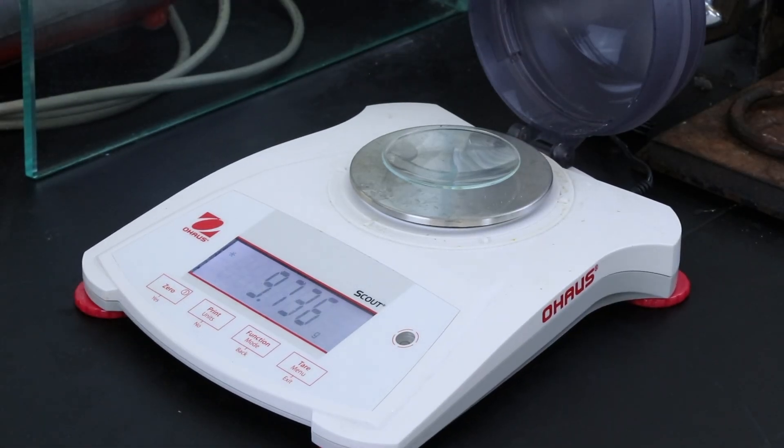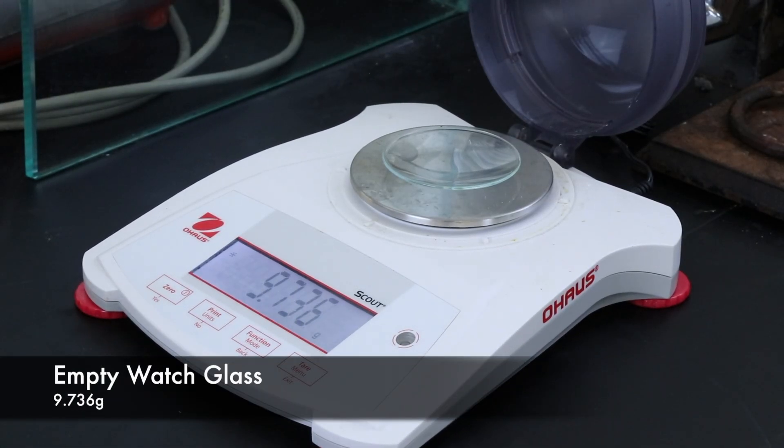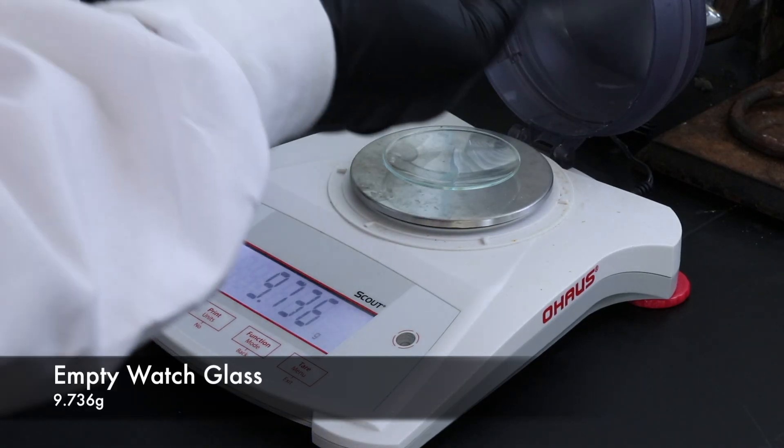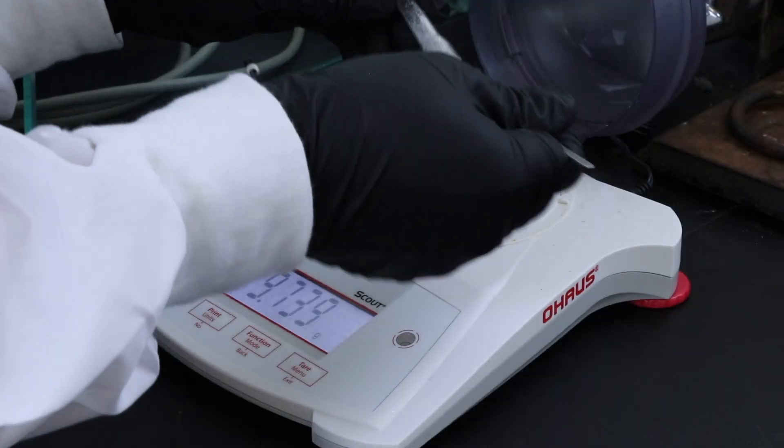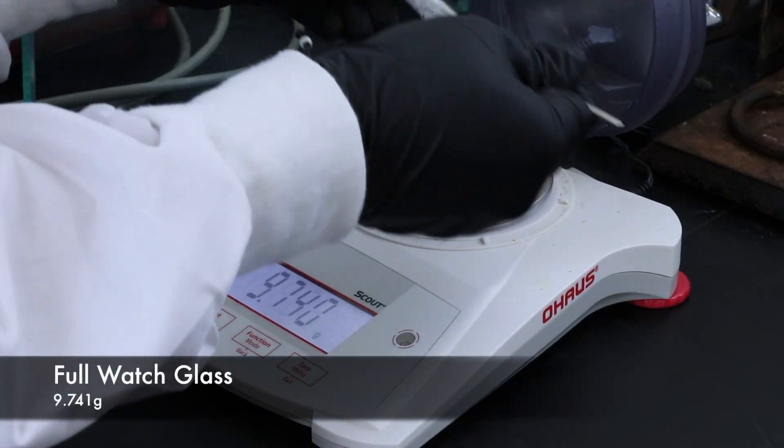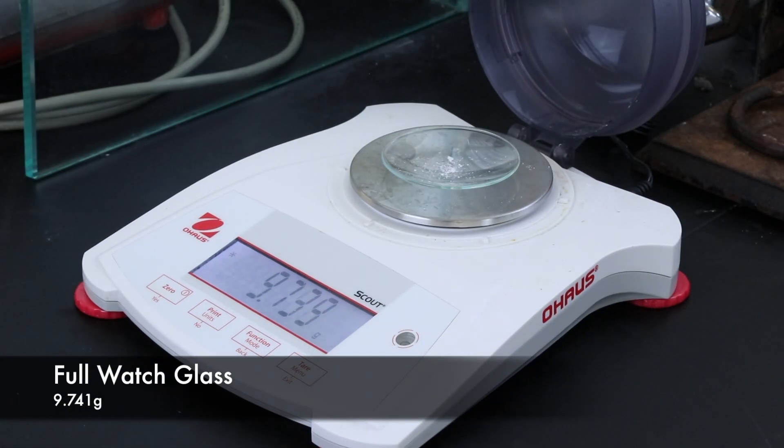Now I'll weigh out the crystals so we can calculate a percent yield. The empty watch glass is about 9.736 grams and the product only made it jump up to 9.741 grams, so I didn't isolate very much but let's characterize it to see how pure it is.